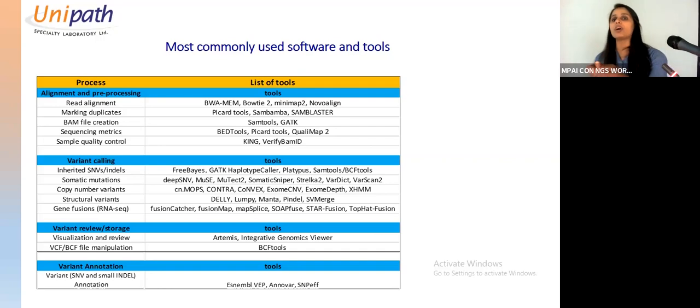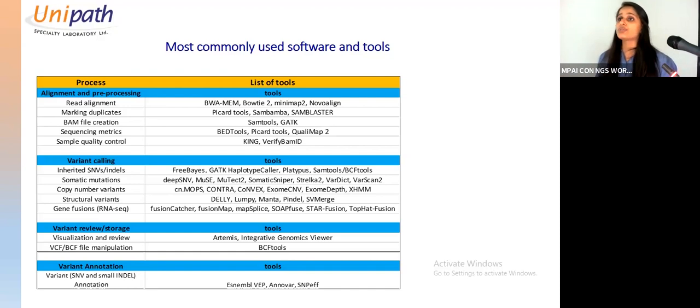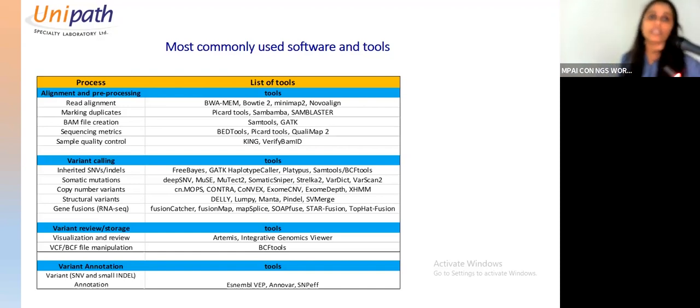For example, if you have got a VCF file from any company and you want to check the variant of your interest, but you don't actually have complete data with you, you just have a report sent by them, and you want to do it by yourself, you can use a bioinformatics program and VEP. You can upload your VCF file there and check out the result.